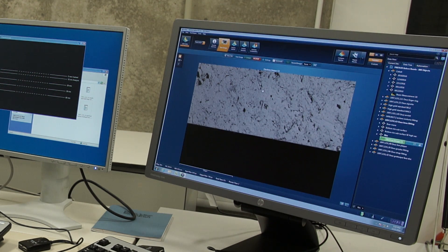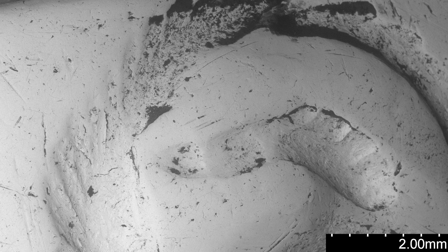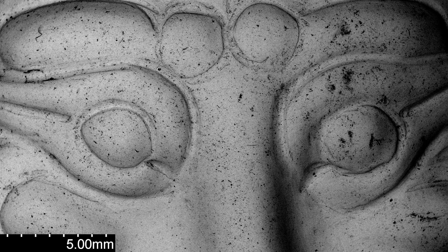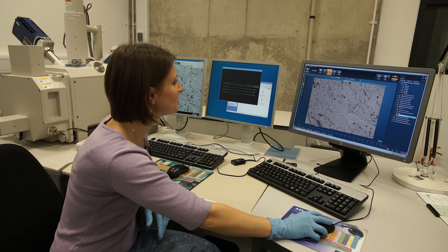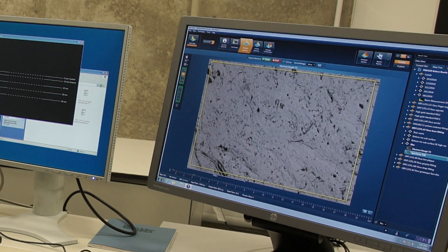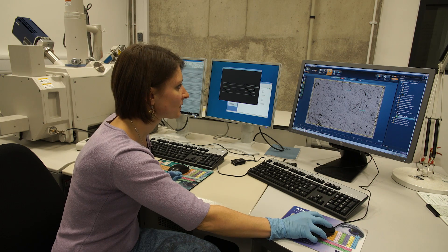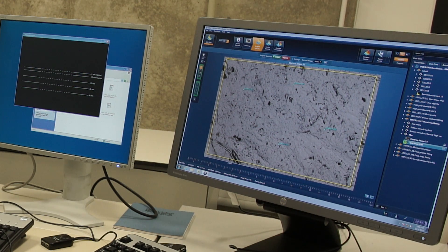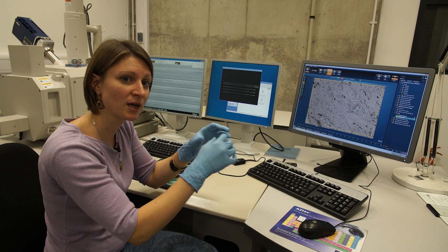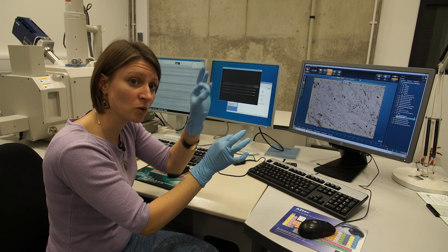This is relatively low magnification — it's 200 times — but you can go much higher if you're interested in a single crystal or phase, as we call that in a metal. Once we have acquired the image of the area of interest, we can choose to analyze a whole area. This whole area inside the yellow square is being analyzed, but I can also choose to do spot analysis. I've done four little spot analyses here.